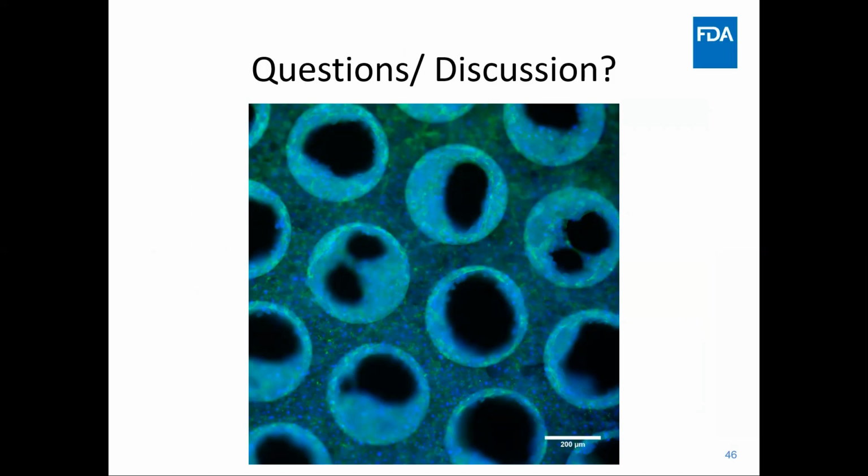In relation to the origin of cells to be used, having cells that, independently of the cells that are used, are functionally stable is all important to basically yield reproducible results. So I think it's important to have a set of compounds that define the function of a specific organ system, and if adding these compounds at a specific concentration yields reproducible results all the time, then I think all of these combined show that we may have a robust and reliable model.